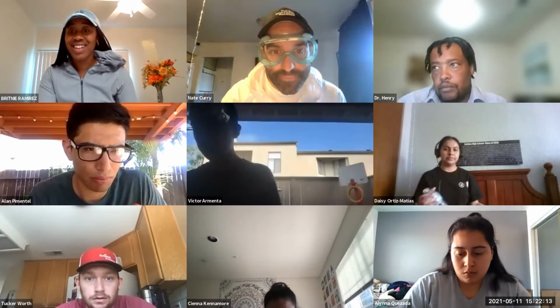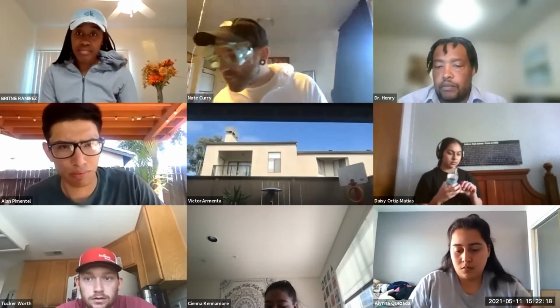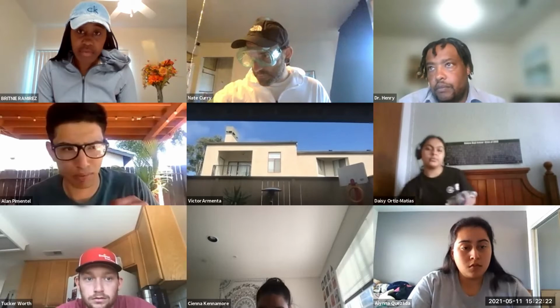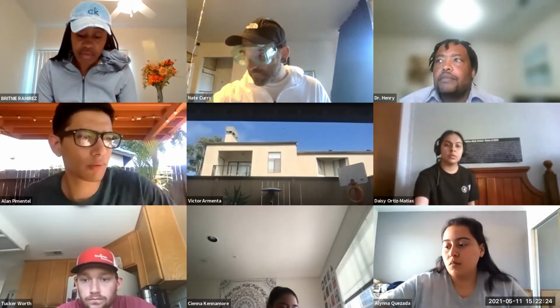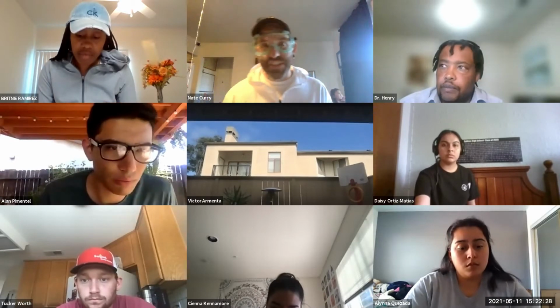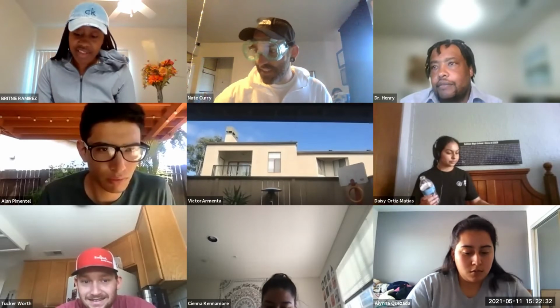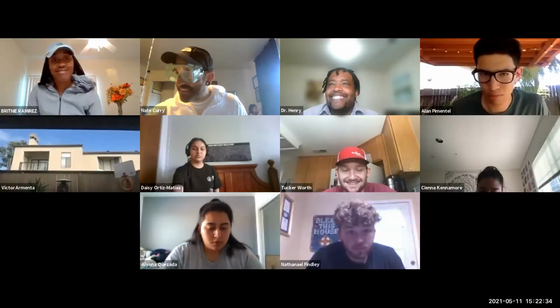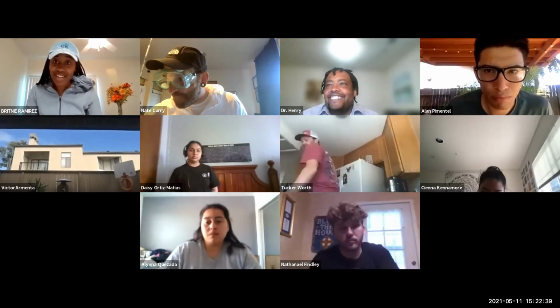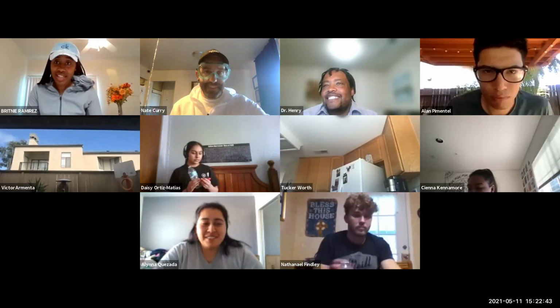It's true. 2.5 grams of Kool-Aid. All right, let's see. Oh my God, on the dot with the first pour. I got those skills from when I was a teenager, you know what I'm saying? Look at that. I could still eyeball 2.5 grams. All right, here we go. That's done.